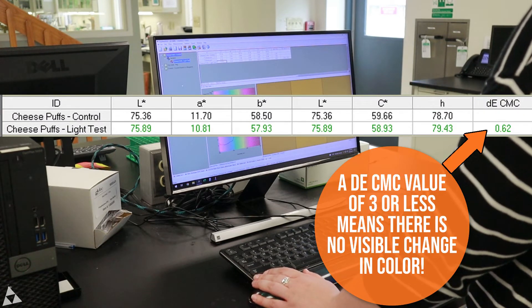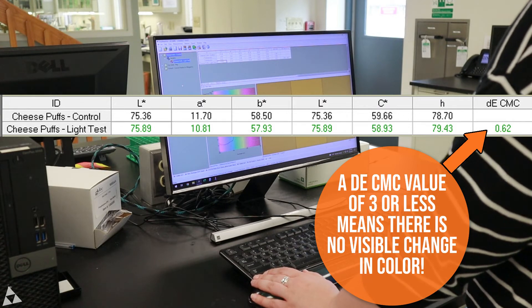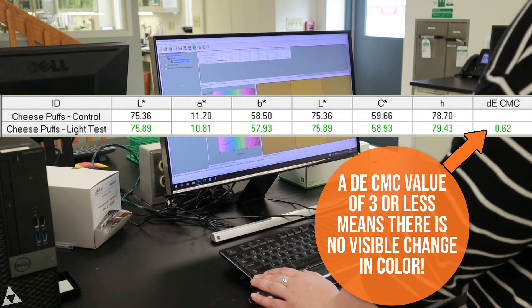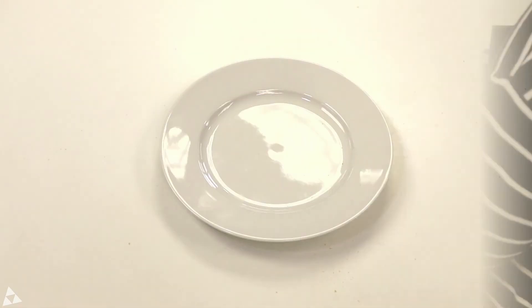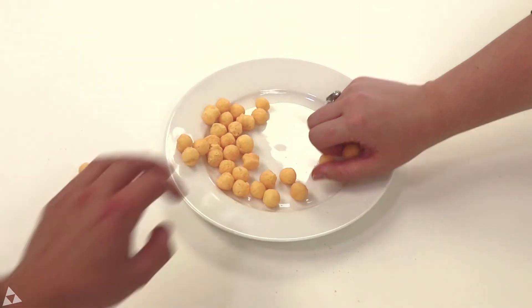We look at the dE CMC value, or the overall change in color. This compares the original color reading to the new color reading and tells if any color loss occurred during the test. As you can see, the before and after readings are extremely close, meaning the annatto color passed the light stability test.